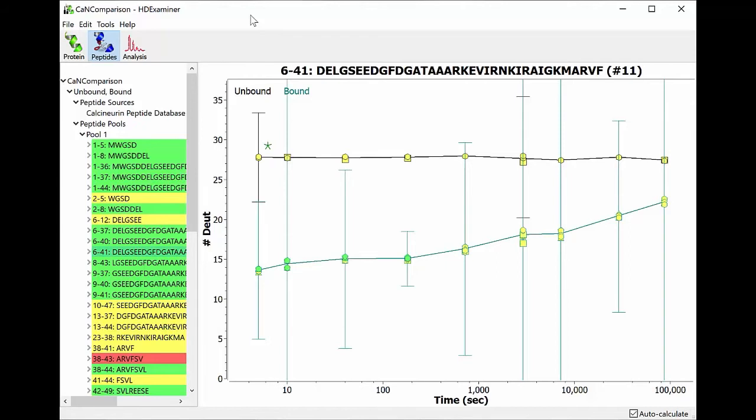So now what the software does is it draws confidence intervals relative to only the best charge state, even if you have multiple charge states. Now what this means is that you're going to generally see larger confidence intervals than before. We apologize for the inconvenience, but this is a more mathematically rigorous way of doing things, and therefore less likely to mislead you into thinking that you have a significant difference when in fact you don't.